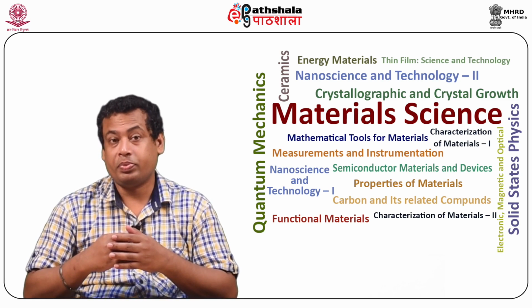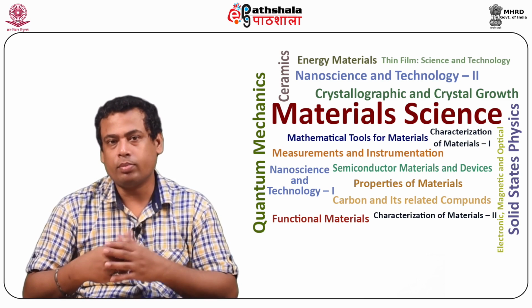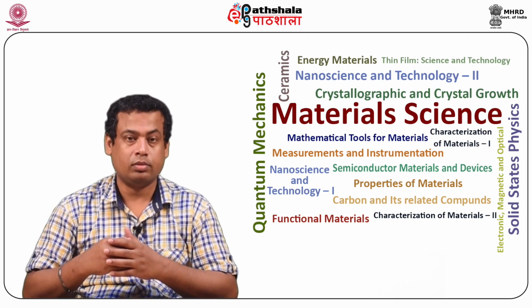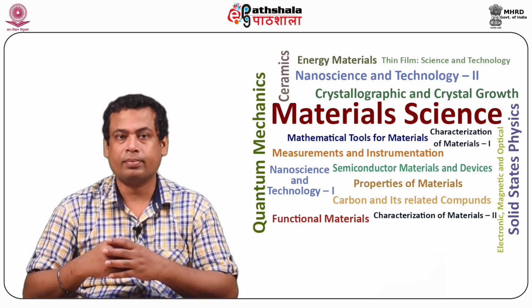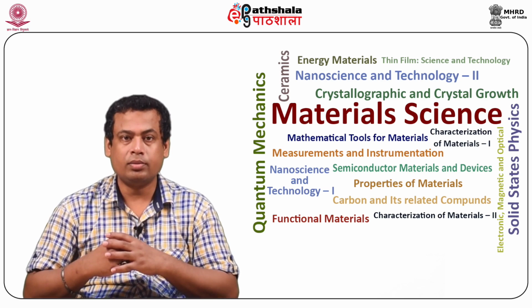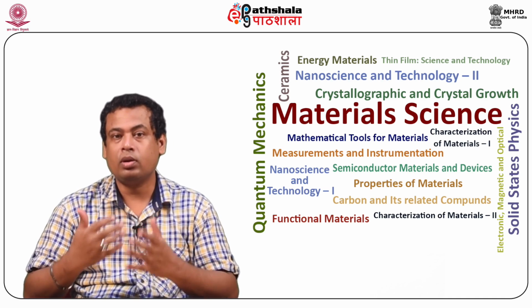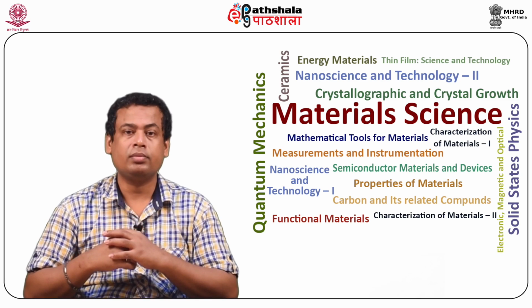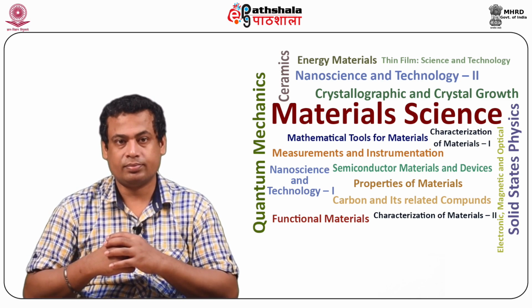Spatial resolution. As we studied in lecture 1 of scanning electron microscope, the inelastic interactions produce diverse effects including secondary electrons, phonon excitation, cathodoluminescence, which is visible light fluorescence, continuum radiation, and characteristic X-ray radiations.